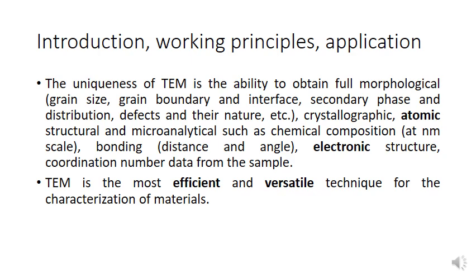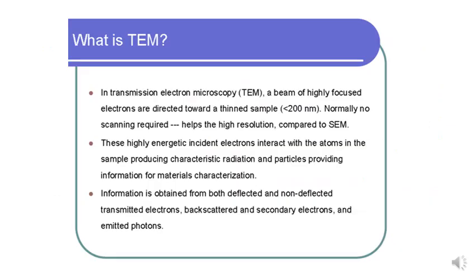With TEM, we can also investigate the electronic structure and the coordination number data from the sample. TEM is the most efficient and versatile technique for the characterization of materials. So what is TEM? TEM is the transmission electron microscope. A beam of highly focused electrons is directed towards a thin sample.